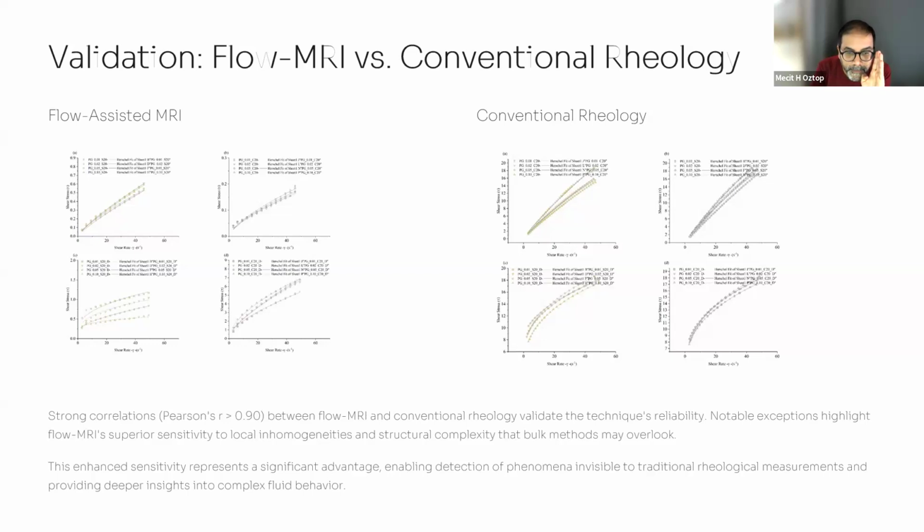The flow MR and the conventional rheology results showed correlations greater than 0.90. So that means this flow imaging is capable of obtaining the rheological parameters.